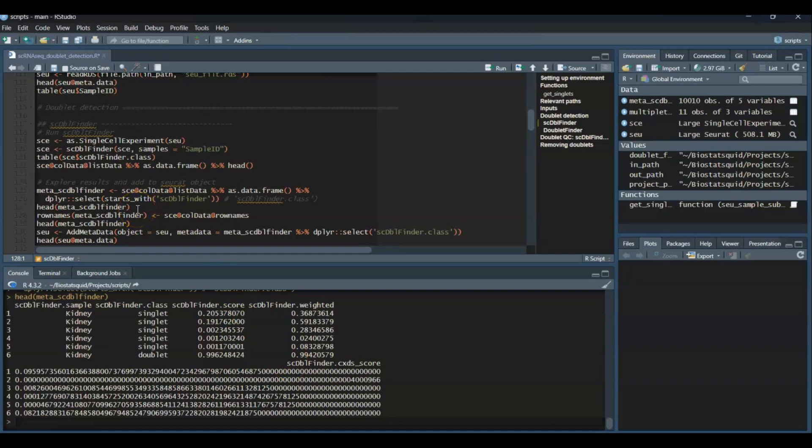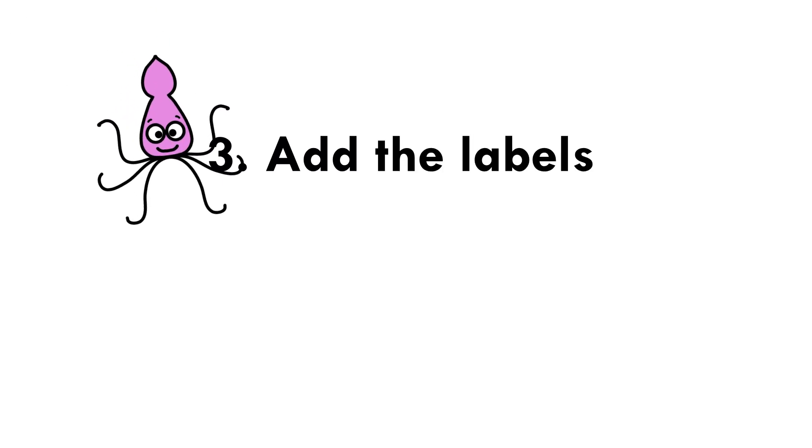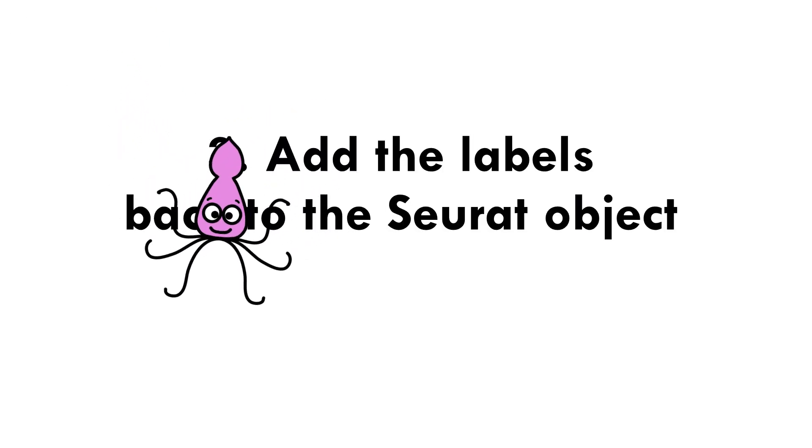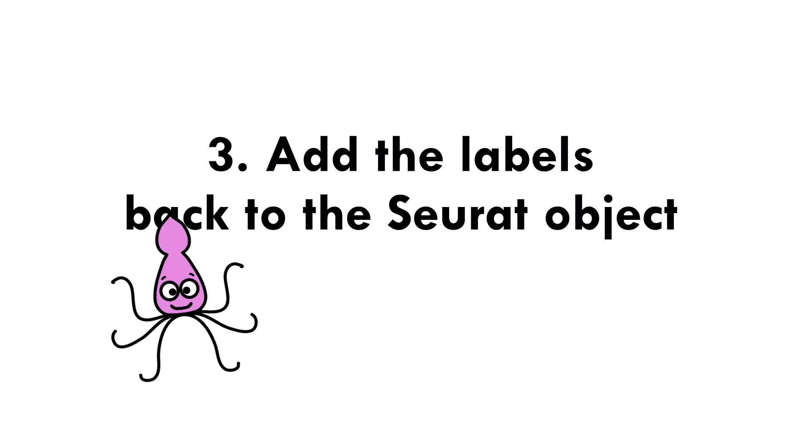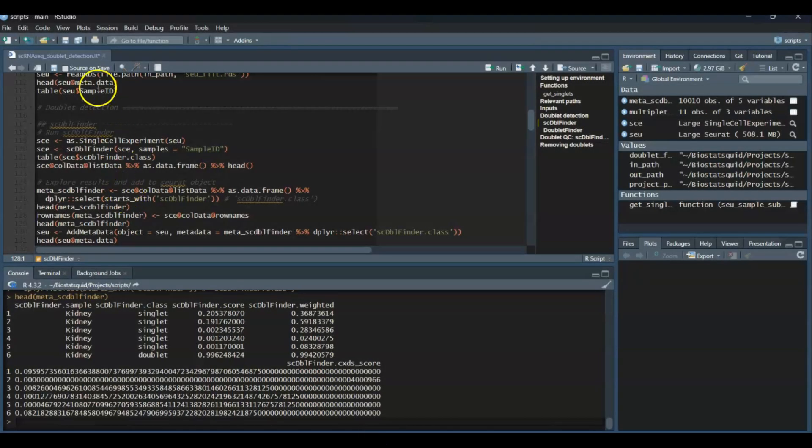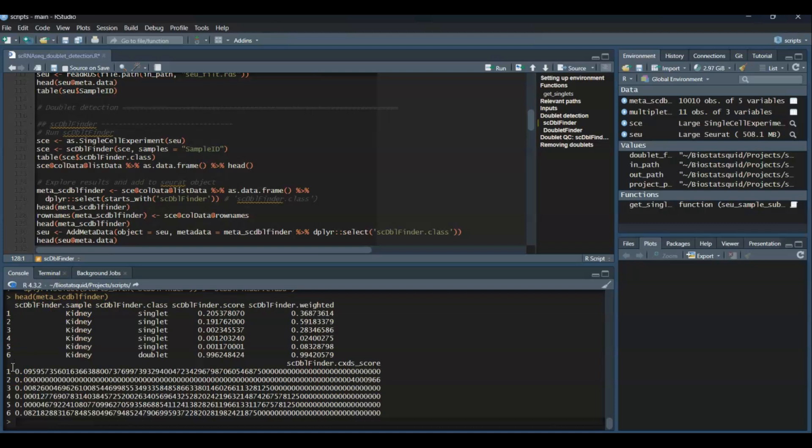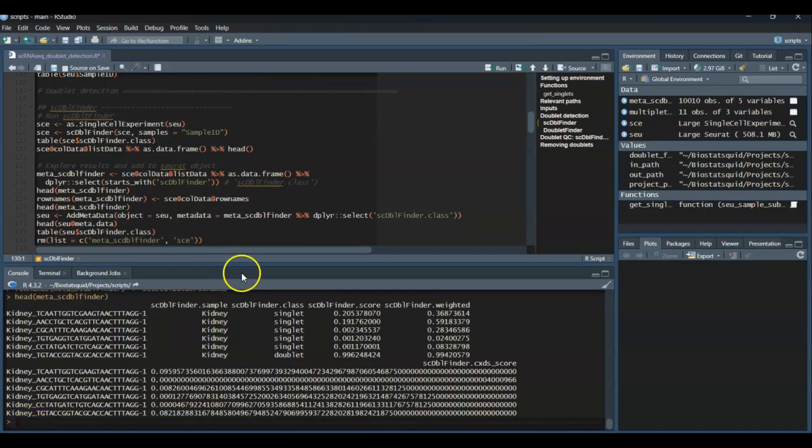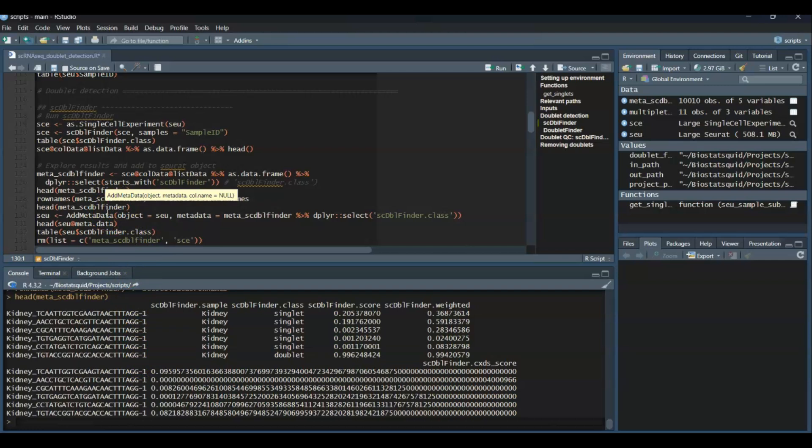Now, if you started off with a Seurat object like I did, we need to add the doublet labels back to the original Seurat object. So we will first extract the metadata, and we will make sure that the data frame's rows are the same as the ones in the Seurat object. So we need to add the cell IDs as row names. We will do this by setting the row names to the row names of the metadata data frame. So now you can see that the row names are the actual cell IDs.